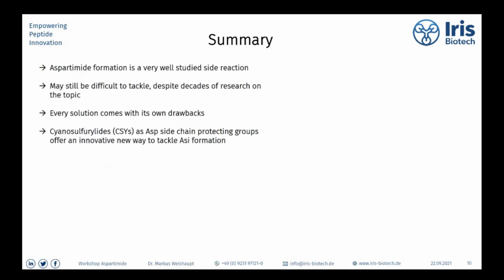Okay, thank you, Marcus. Thanks for this introduction to the topic. If you have any questions for Marcus, please type them in the Q&A chat. By now, we have received one question. Marcus, does aspartimide formation also occur when you're applying the Boc synthesis strategy? Yes, indeed it does. However, the problem is more pronounced when applying the Fmoc strategy.